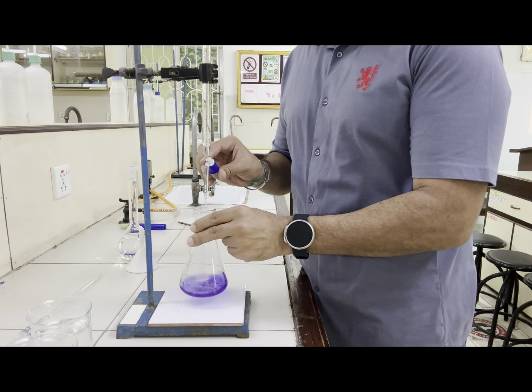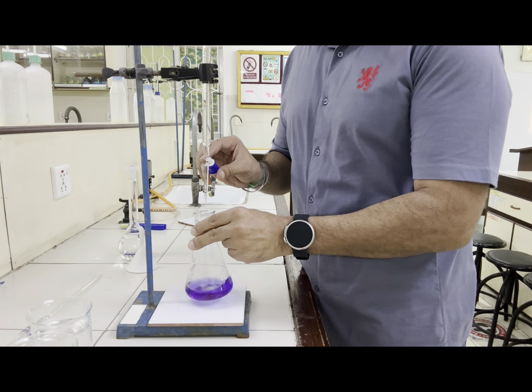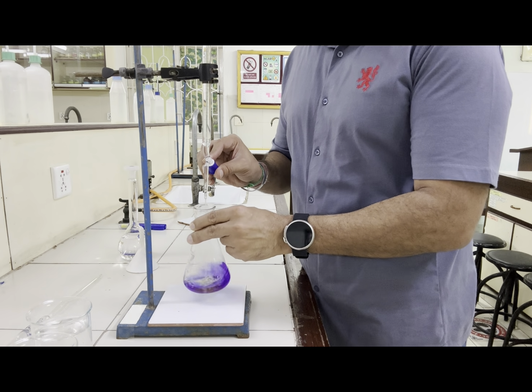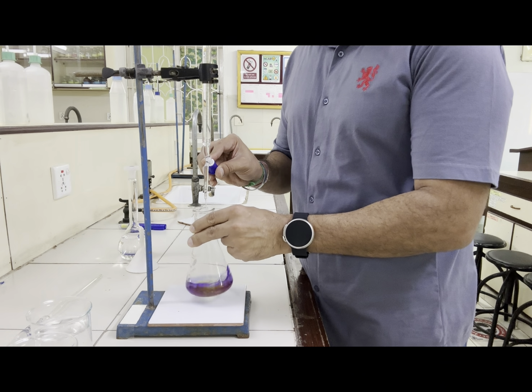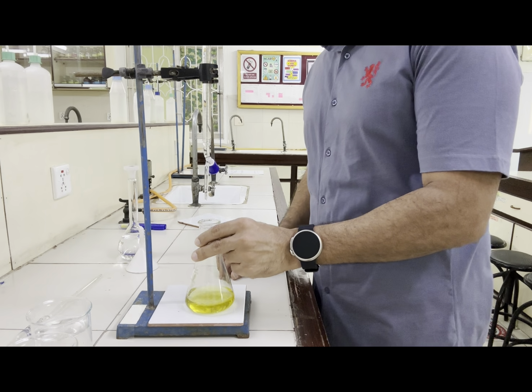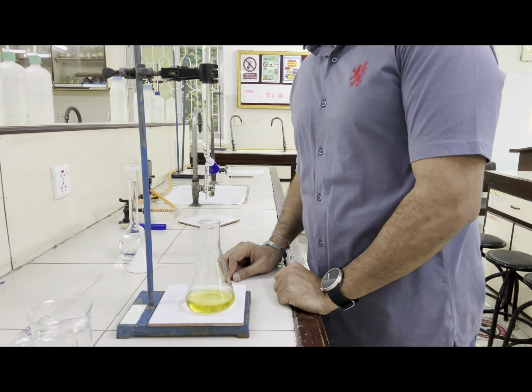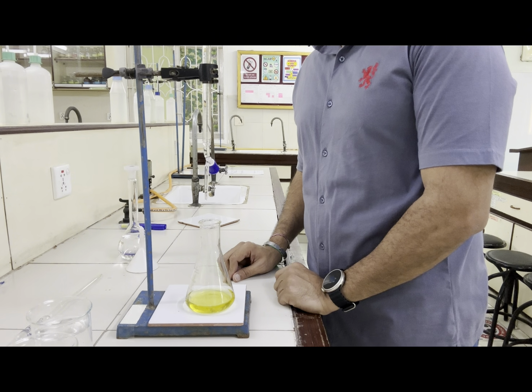So I have opened the tap. Now the solution is going a bit lighter and the solution has turned completely yellow. So this is the end point in rough titration.